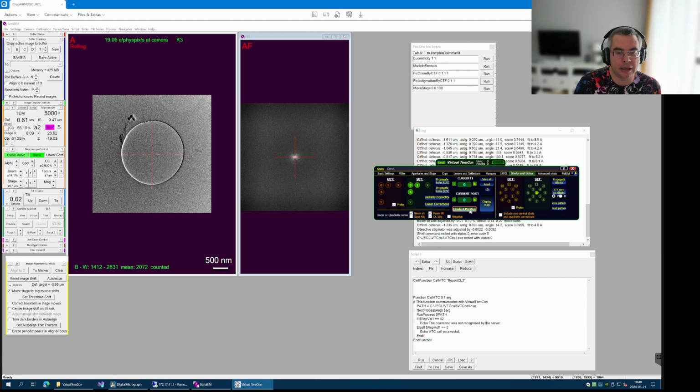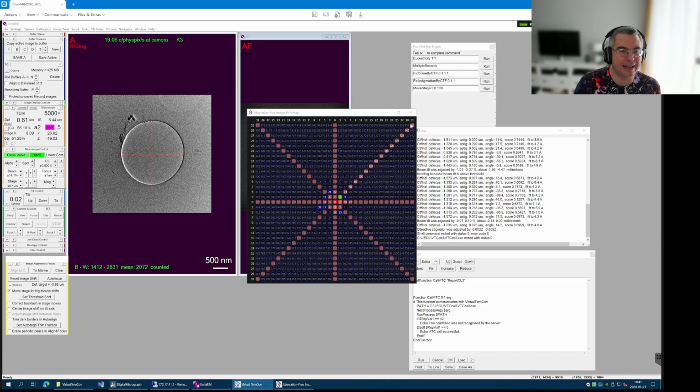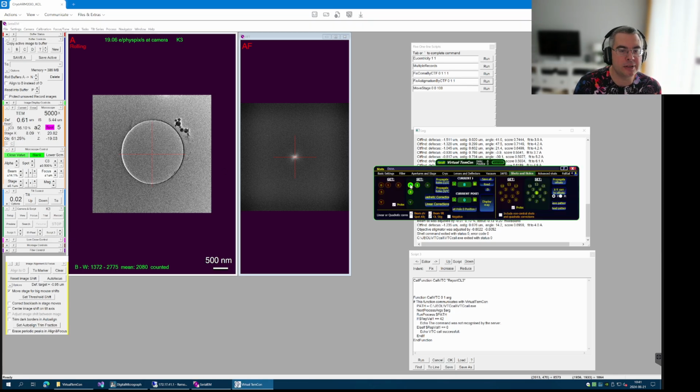After we did it, we can display map, and this is our preliminary map. It shows us what's possible. So in this case, let's go maybe to hole number 8, and let's take a view picture. Let's see what happens. And indeed, we are on hole number 8. So this is good. We've got the preliminary alignment right, using this low mag, so 5,000, for example.